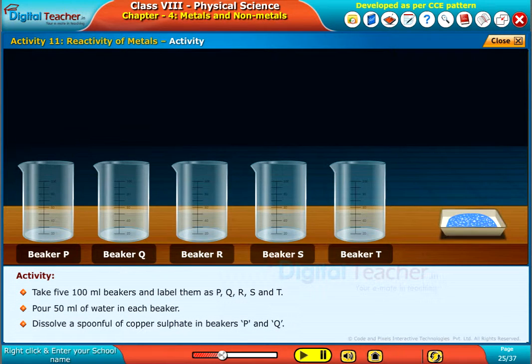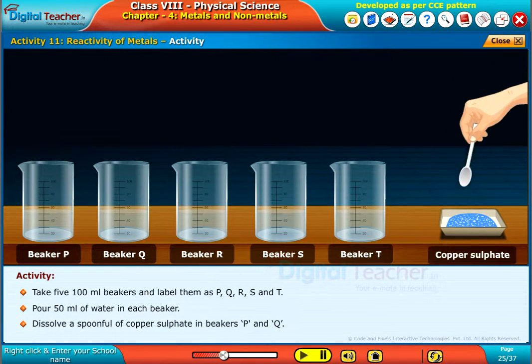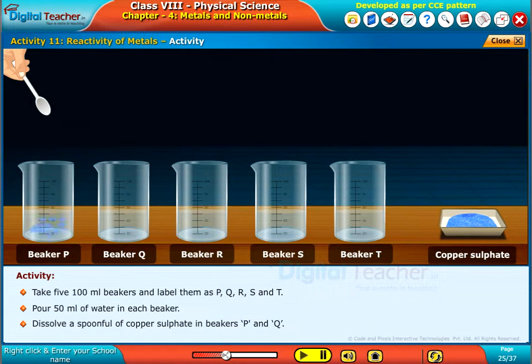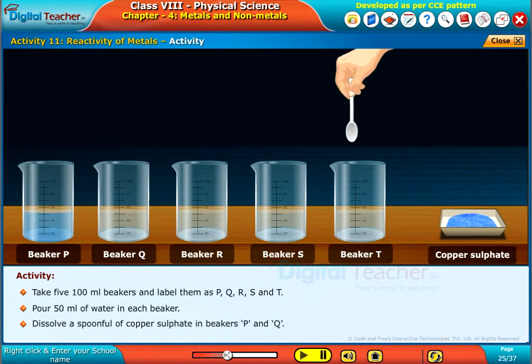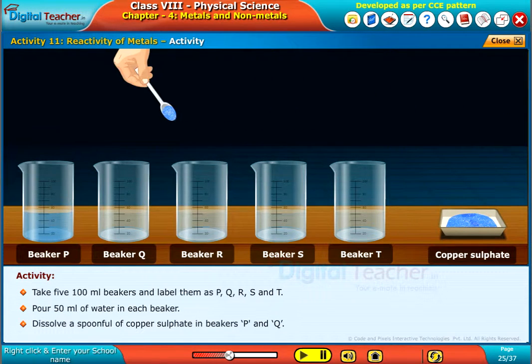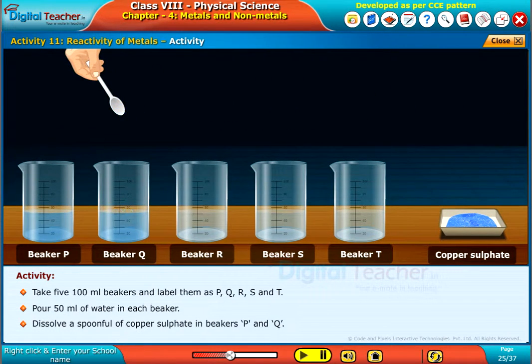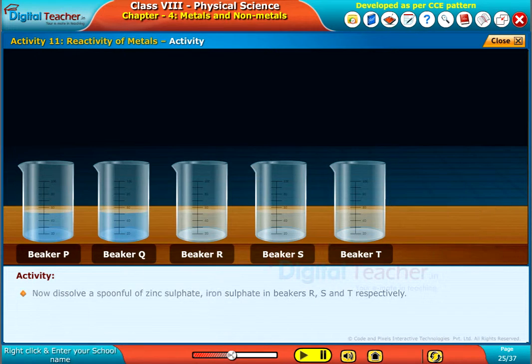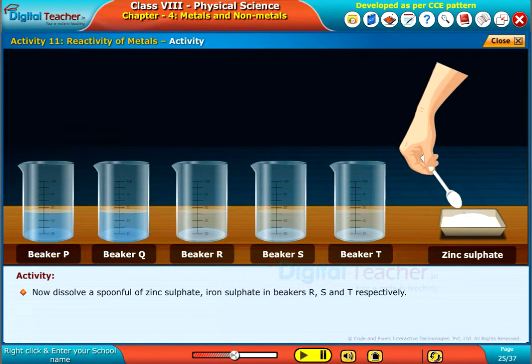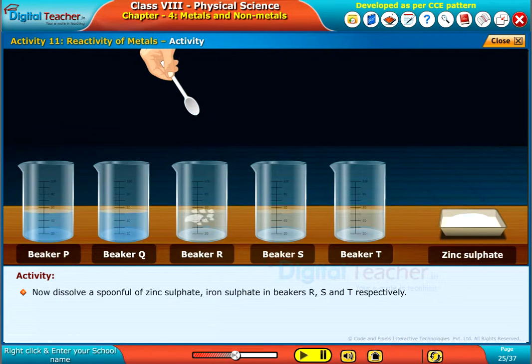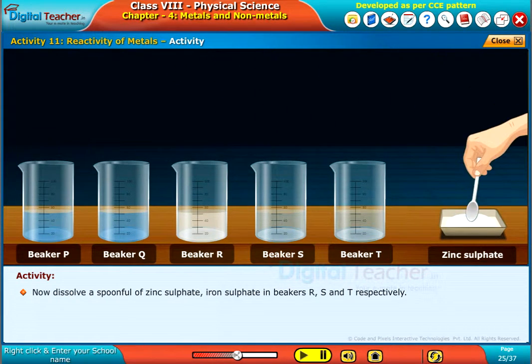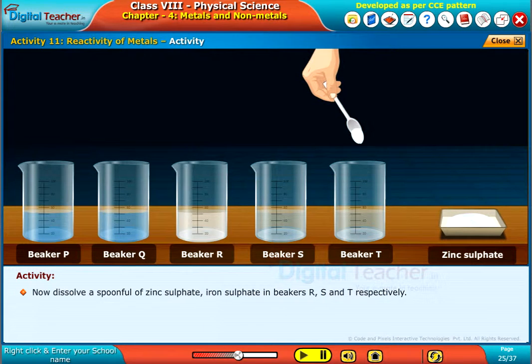Dissolve a spoonful of copper sulphate in beakers P and Q. Now dissolve a spoonful of zinc sulphate and iron sulphate in beakers R, S and T respectively.